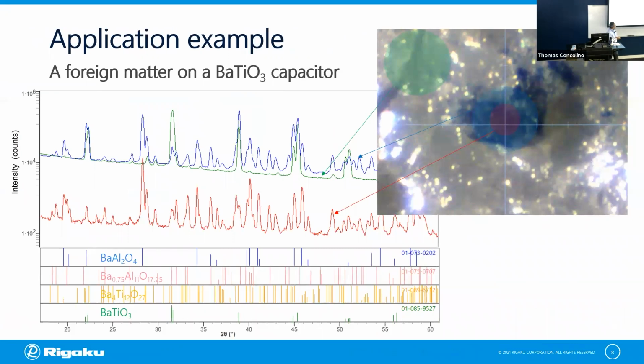Okay, and this is the same sample as the image on the first page of my presentation today. There's a black spot in the microscope image, which has about a 1 micrometer diameter. Outside it is white, which is supposed to be very tight. This is a comparison between the different places. First of all, there's the green here. Maybe I can use a mouse.